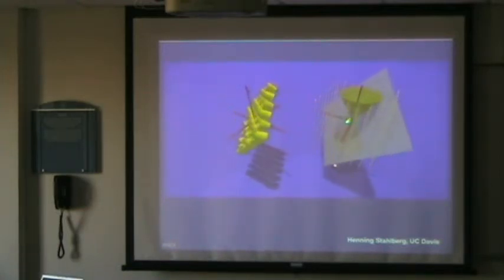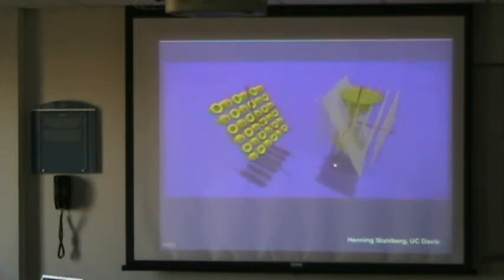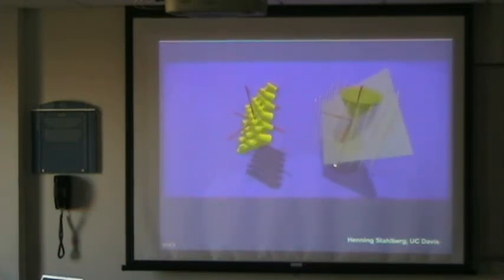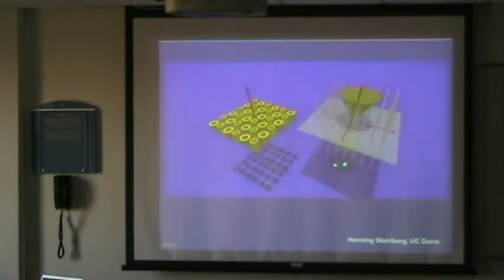The plane in Fourier space essentially does the same thing as the planes do here. These different views in projection correspond to continuous amplitude and phase information along each of these lattice lines. And that is your 3D information, ultimately.